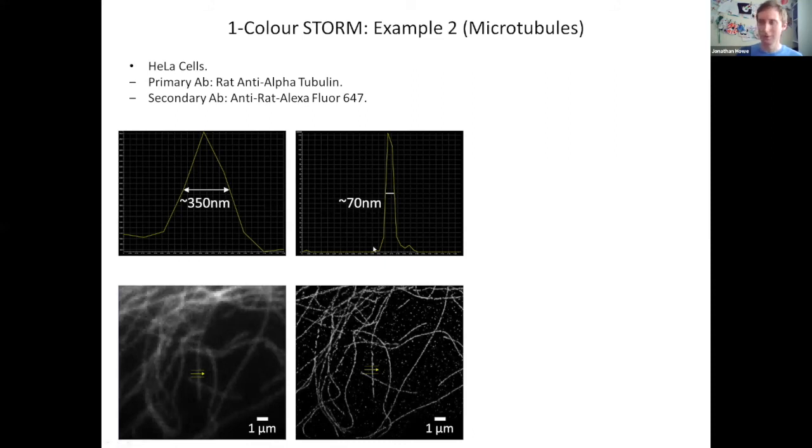This is still not at the diameter of the microtubules, which I'll explain in a moment, even though our localization precision for each individual fluorophore is probably 10 nanometers.